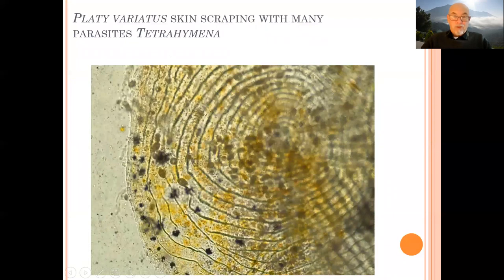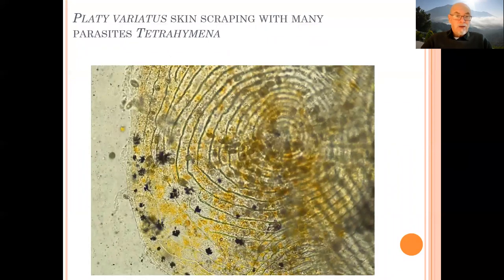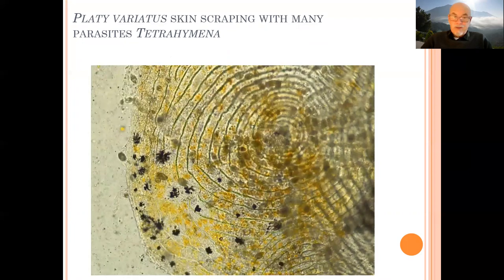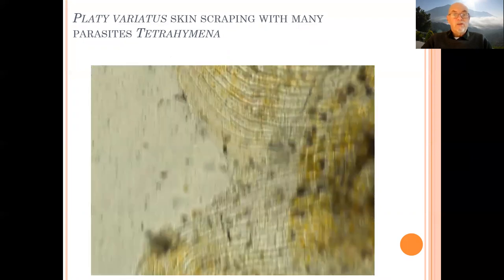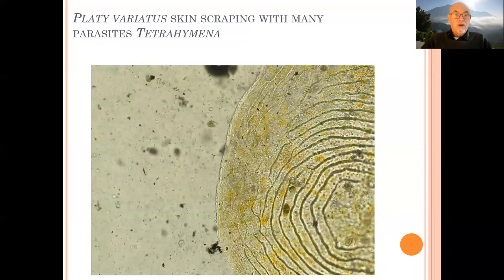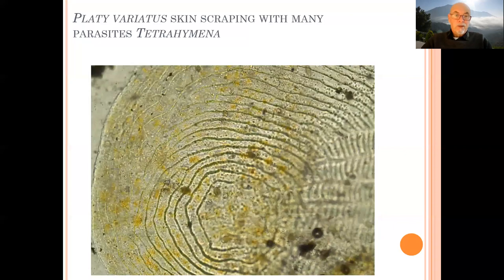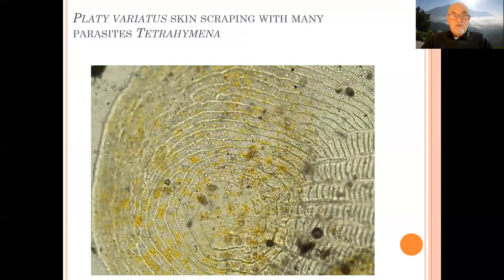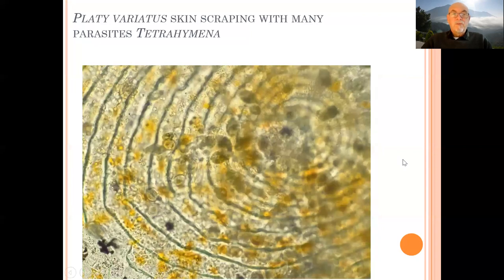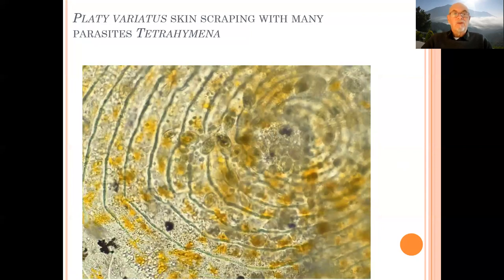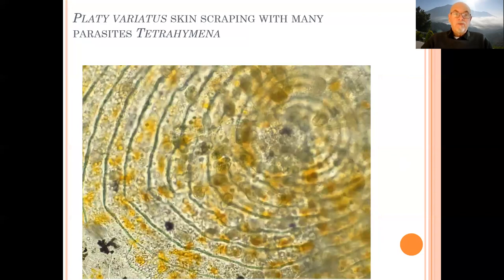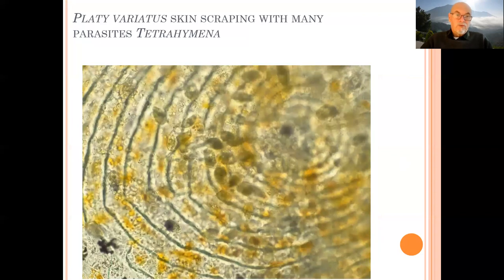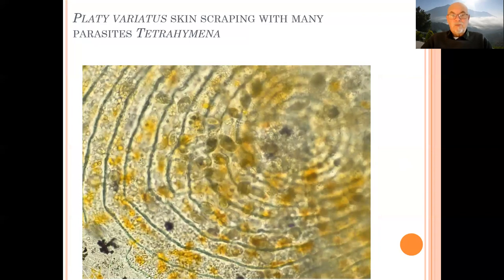What was very obvious — we took a scraping — and you see the many parasites moving on the fish scale. Those parasites are the ciliated protozoa called Tetrahymena, and they can divide very rapidly. They can invade all over the body of the fish. Here at a higher magnification you see they're moving around, they're damaging the mucus of the fin, the skin of the fin, they're damaging the scales.